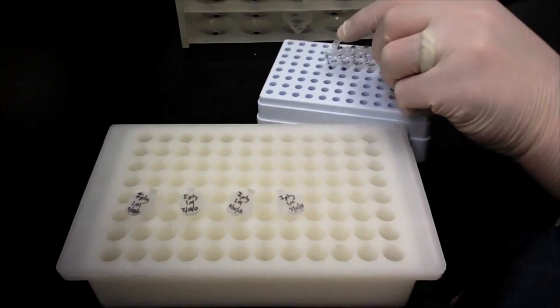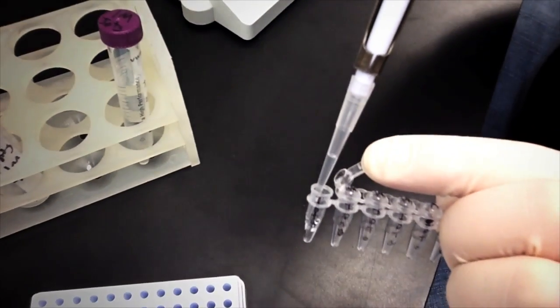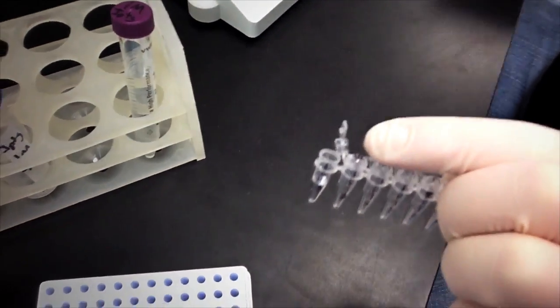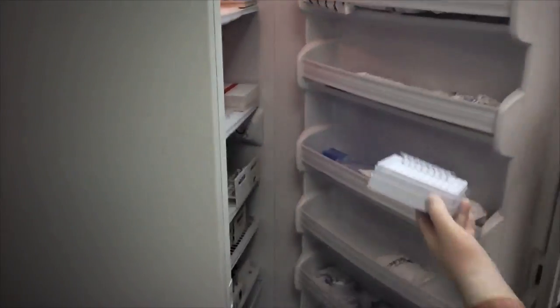What I do is, since I only need around 100 microliters of a 1 molar stock solution per use, I aliquot mine into 8 strip PCR tubes, then I put them in an old pipette rack, put it in the freezer, and whenever I need some I simply cut off a tube and I'm ready to go in a matter of minutes.